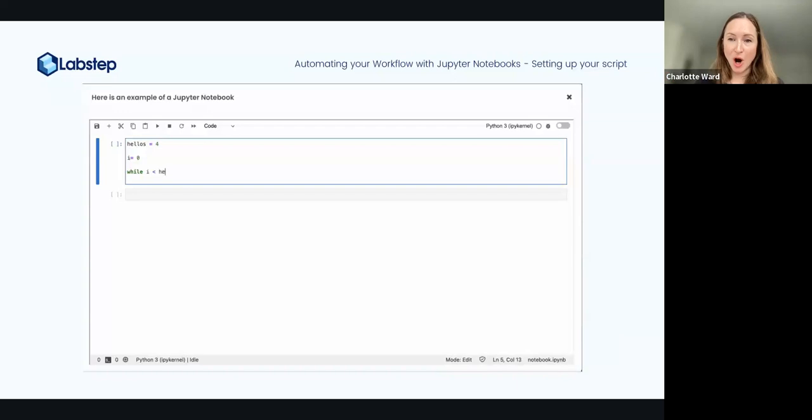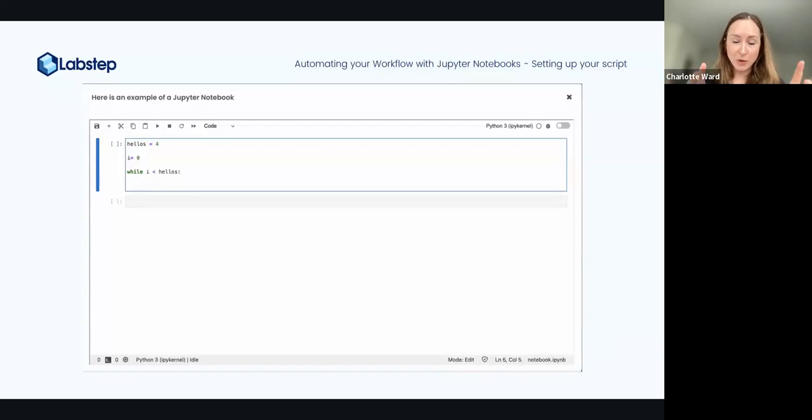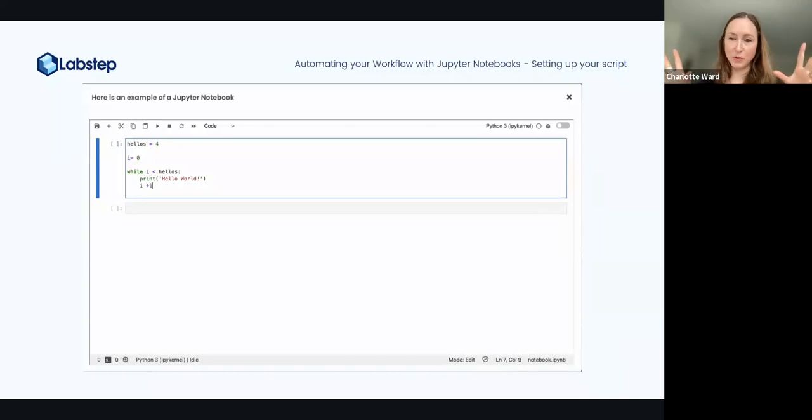When you want to open up the Jupyter Notebook to edit, like what's going on in the screen right now, you simply have to click on that interactive element that you've inserted. You just click on it, and it will launch the server by itself, and it all happens automatically.